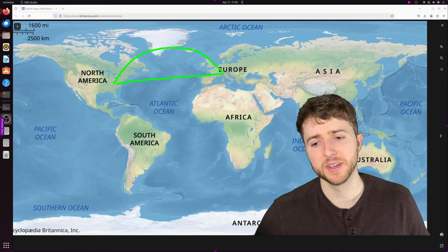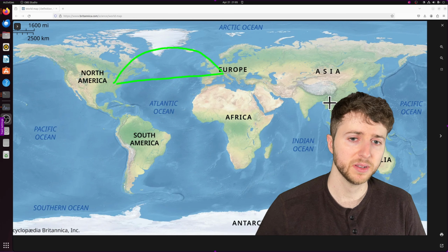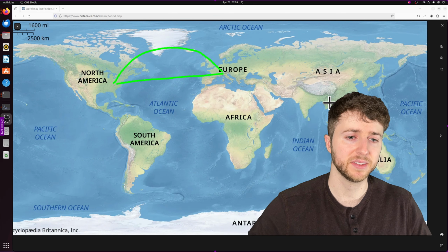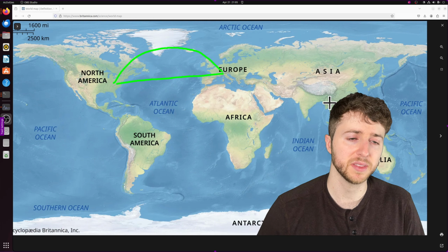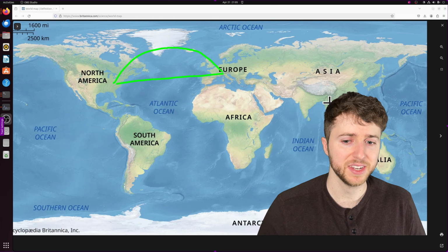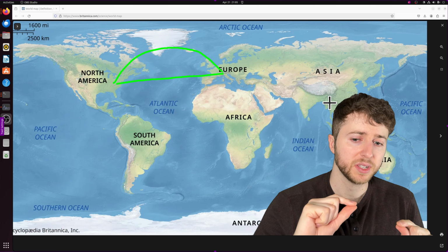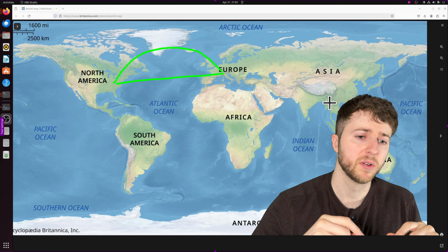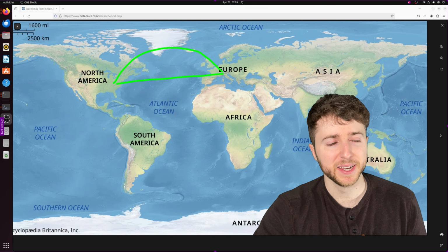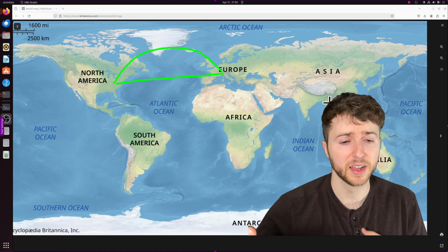So if you think about the underlying structure of your single cell data as the globe and a UMAP as this 2D map, just be aware that the UMAP can distort the distances between the data, and it's not a one-to-one representation of the distance between data points. So just because 2 cells are close together on the UMAP or far apart, that doesn't always mean that they're more similar or more distant. Some people might say that they're completely useless, but a lot of other people might argue that there's still a lot of use for them.